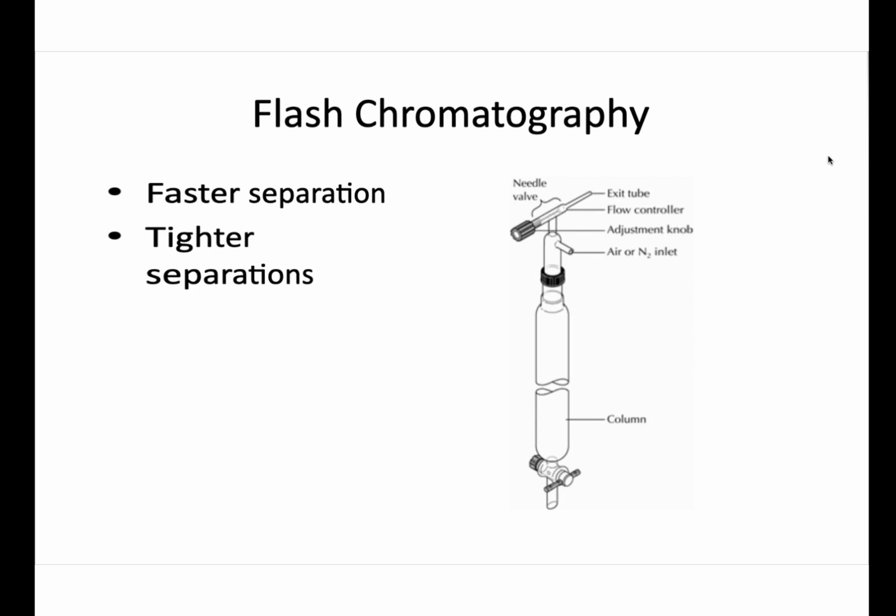We have two types of column chromatography. One of them is gravity. We allow the solvent to be eluted under the pressure of the atmosphere, or under the gravity attraction of the mobile phase. And the other one is flash chromatography. We use a blower to put air in a secure closed air system.